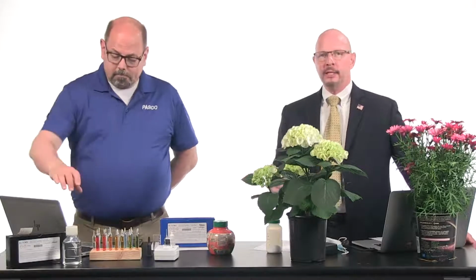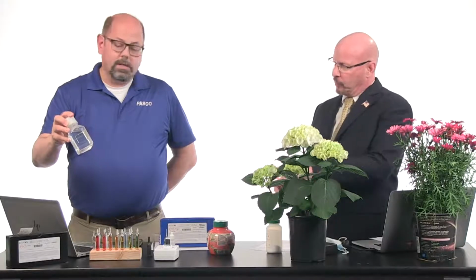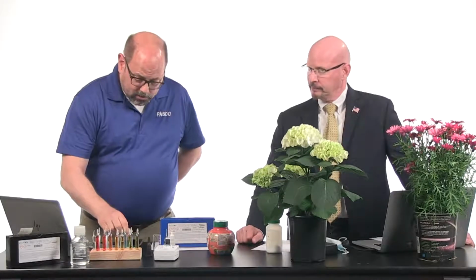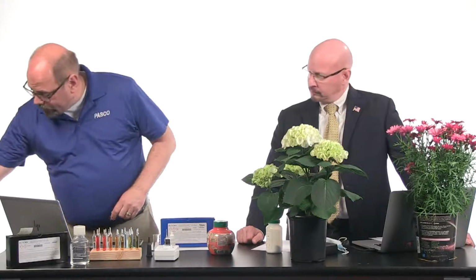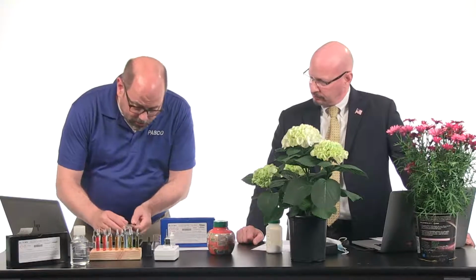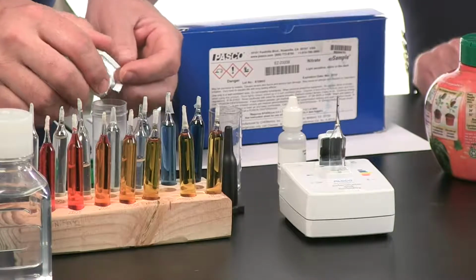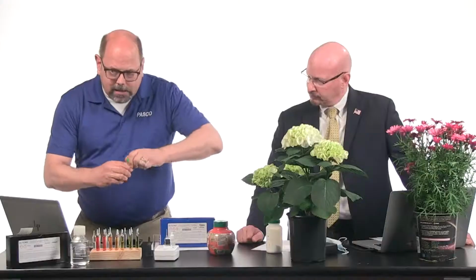So Roger, you went down to the stream, you collected that. What we didn't get to see is how you actually did the actual science behind the capsule and whatnot. Could you show that? Absolutely. So I've taken a sample of the creek water. I've poured in my pre-measured amount, which it just described how much you need. What you're going to do is use your pre-mixed packet, which I have off to the side. It's a zinc kind of a compound that goes in. I'll pour that in. And you got to shake this for a minute.